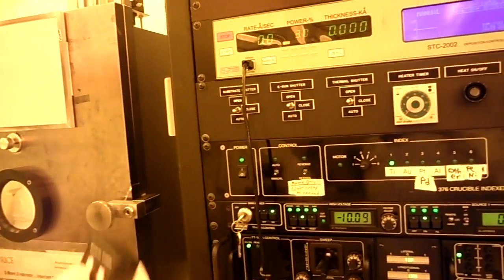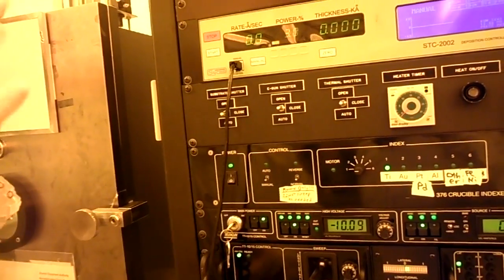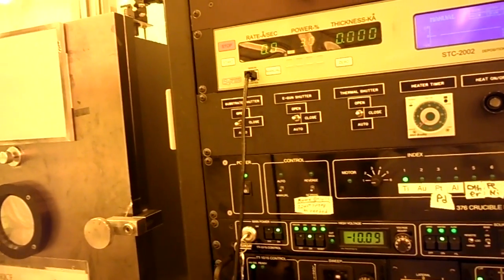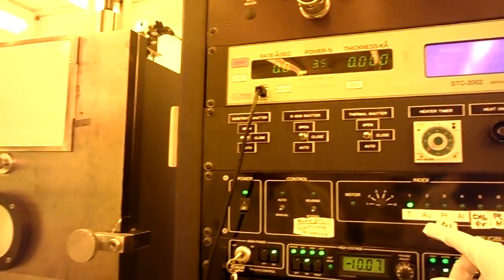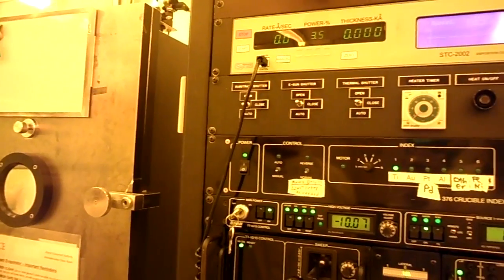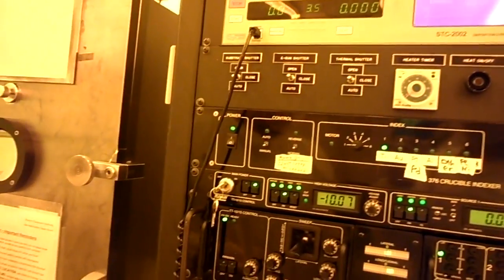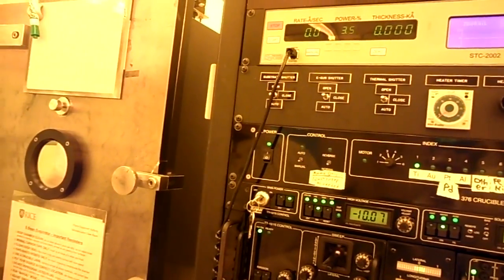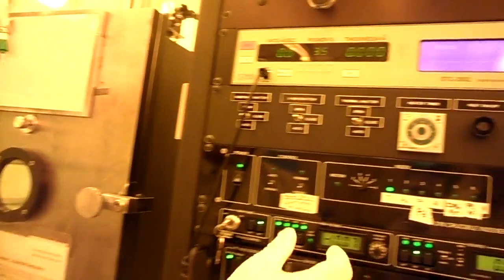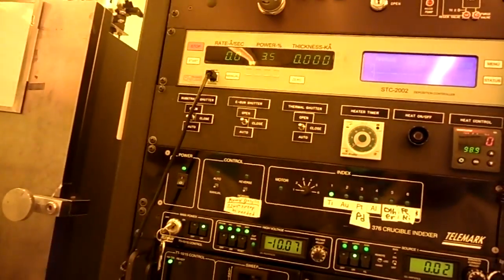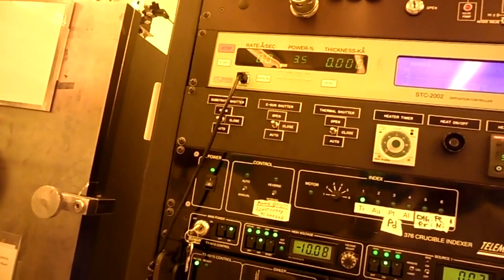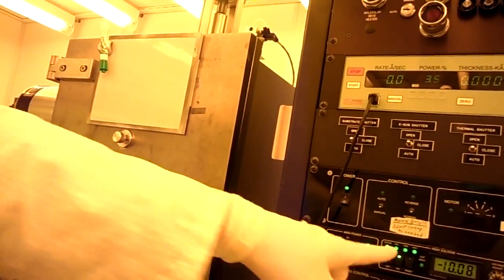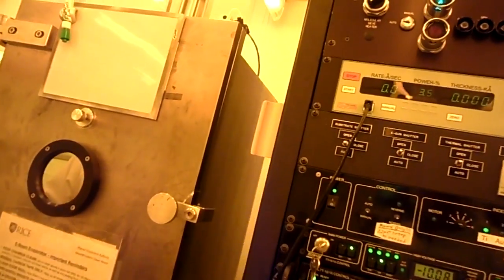Now, I know from experience that titanium is going to evaporate at 3.7%, 3.8%, 3.9%, something like that. Maybe 4%. It just depends on how well things are working. So I'm going to go ahead and go up to like 3.5%. Power depends on the material - titanium, gold, platinum. Gold will need a little more. It'll need like 4, 4.5% to do gold. Platinum would be a little more. And a lot of that's a factor of melting point and things like that. Now, this is percentage of the whole. This is a 10 kilowatt supply. We have 10 kilovolts, so we have up to an amp. We're getting 3%, so we're 30 milliamps or 40 milliamps or something like that. It's just not a lot of current, but that's the beam that's actually striking the source. So we don't need a lot of current if every electron's hitting it with 10 kilovolts of acceleration. We're going to heat it up.